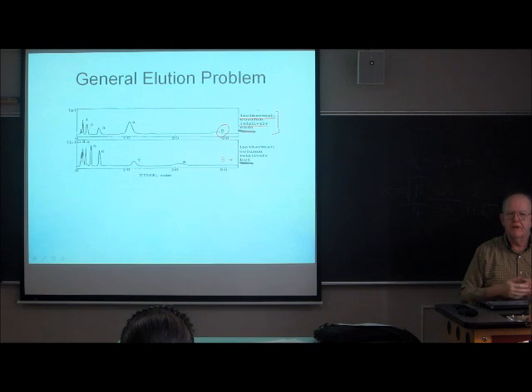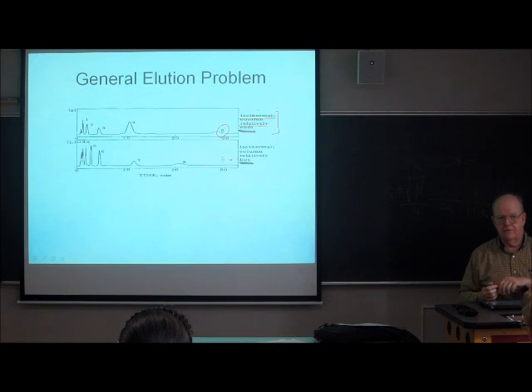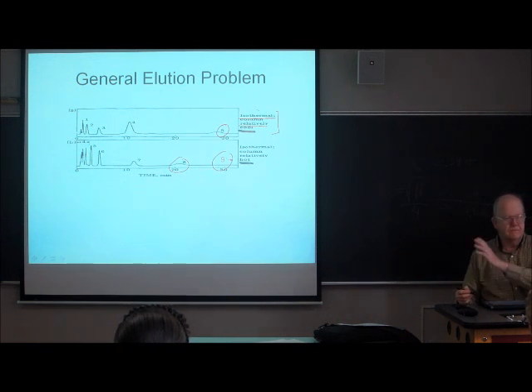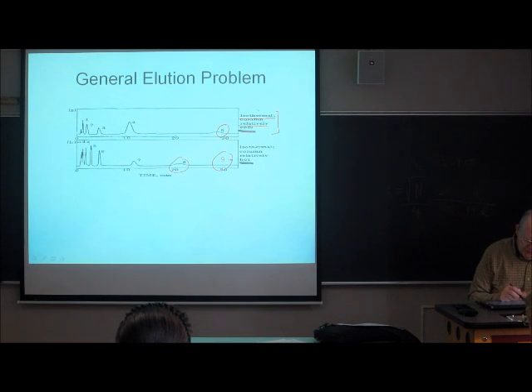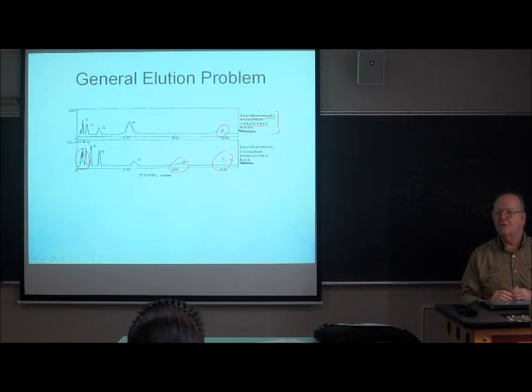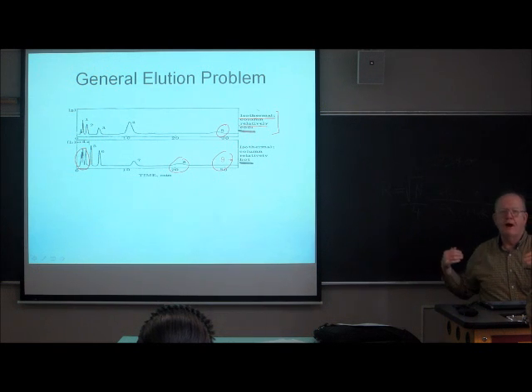So what do? We change the temperature, make the temperature hotter. Everything comes out earlier. We now see 8 peaks, with the 9th peak coming out maybe tomorrow. But look at these early peaks. Peaks 1, 2, 3, and 4 are now squished together. The issue is that it may, in fact, be impossible to find a compromise temperature between too cold and too hot.